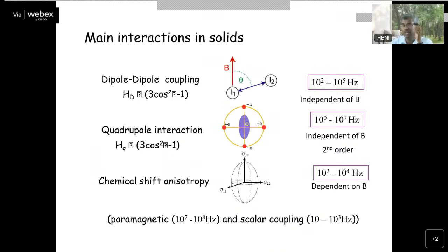What I am planning to do is that in the first 2-3 or 3-4 classes, all the physical aspects of solid state NMR will be described, and then probably in the 5th, 6th, 7th, 8th classes we will go through some examples. Then 1 or 2 problems we will solve on how we can use solid state NMR to predict the cation distribution. This is what we have planned, and towards the end, maybe the 8th, 9th, 10th or 11th, 12th classes, we will discuss multi-dimensional NMR, then cross-polarization techniques and multiple pulse sequences, etc. So let us go further.